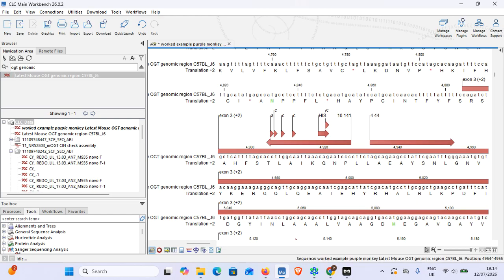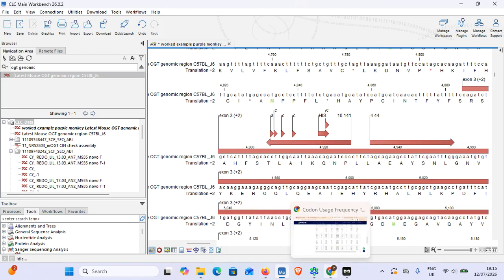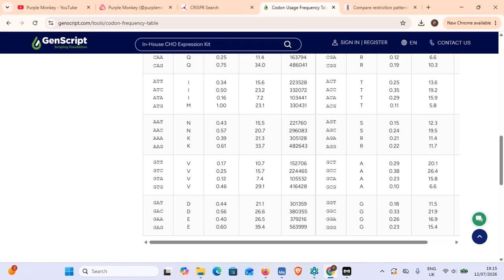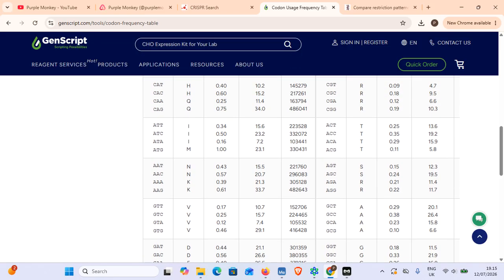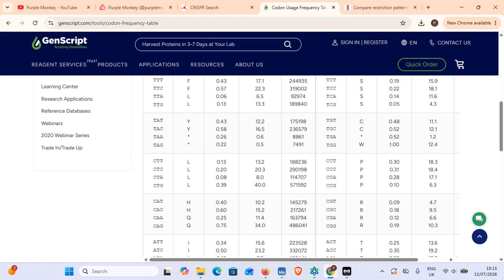Now, drum roll, let's switch to this brother. So, the PAM site in this case is TGG, so that middle G is the last of this L codon, so that L definitely has a date with destiny. So let's see what we can see about that.